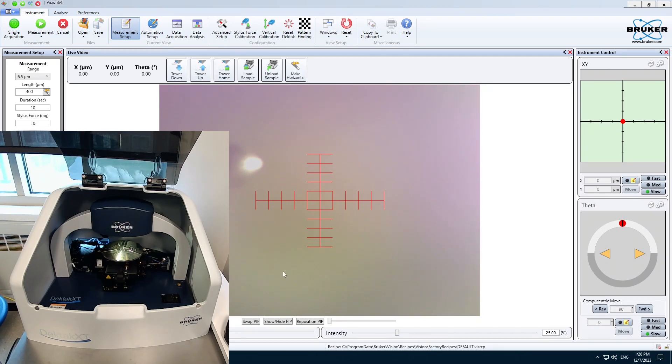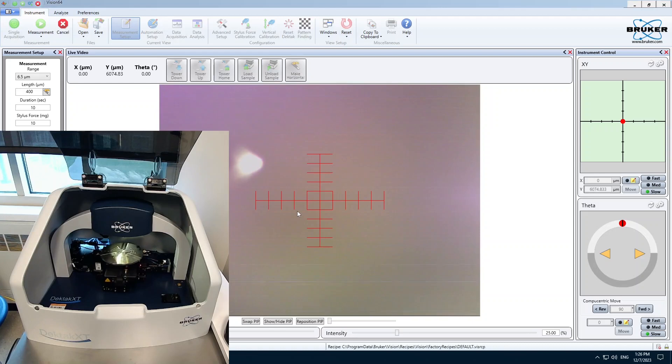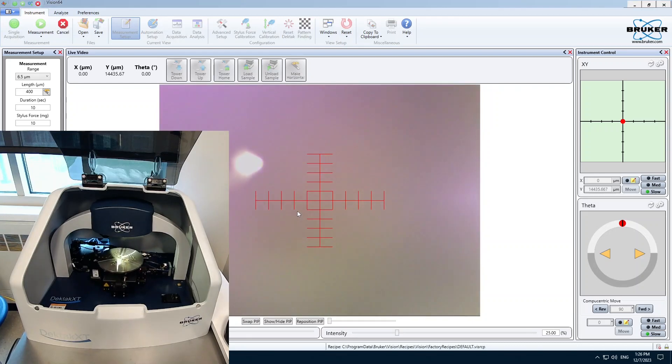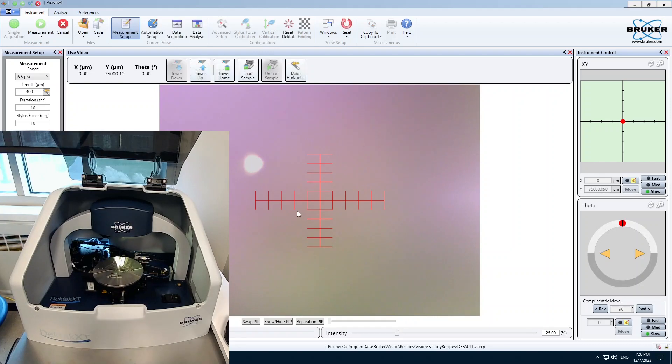The first thing that we can do to get a sample on the stage is to click Unload Sample. I'm going to move the stage forward, and we can place a sample in the center of the stage.